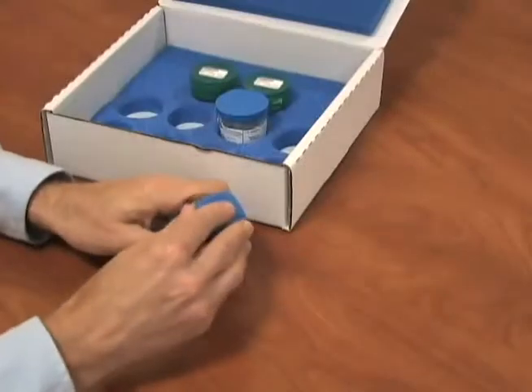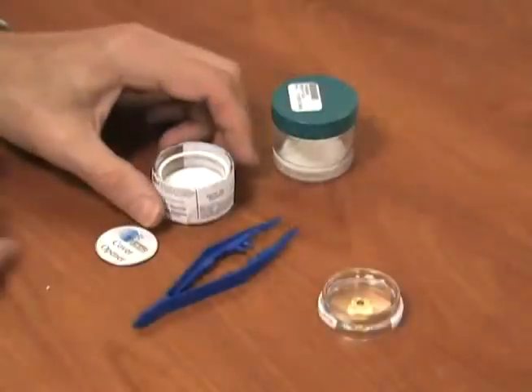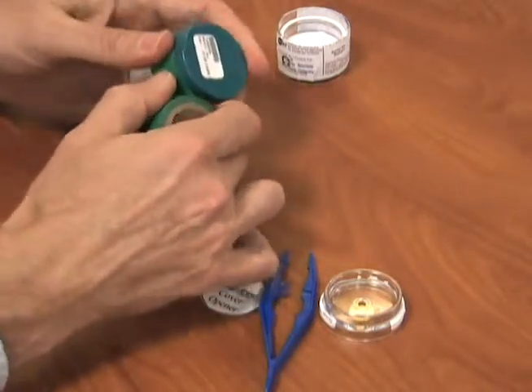Reinstall the top ring and nibs, ensuring the jar and the filter cassette have the same sample ID. Reinstall the cassette into the shipping container and place it in the blue foamed packing box.